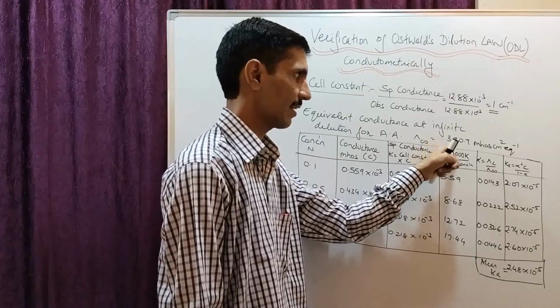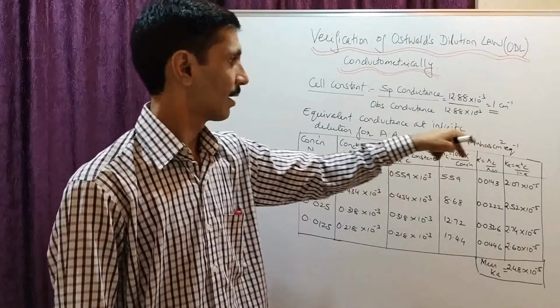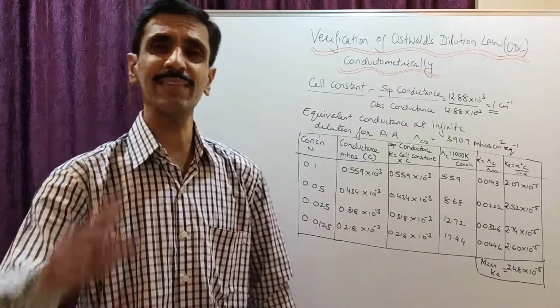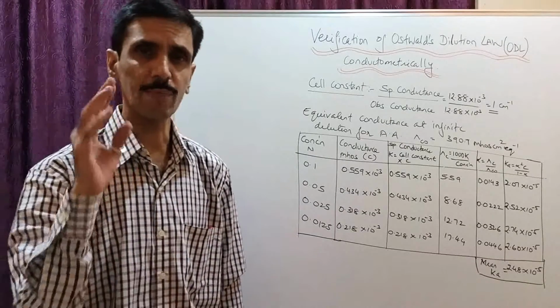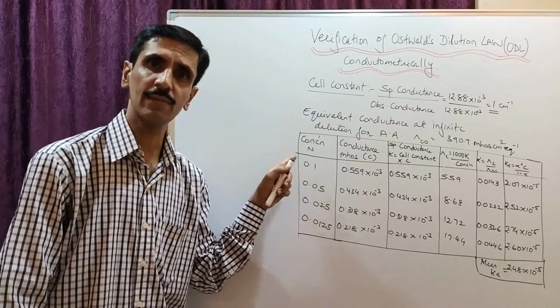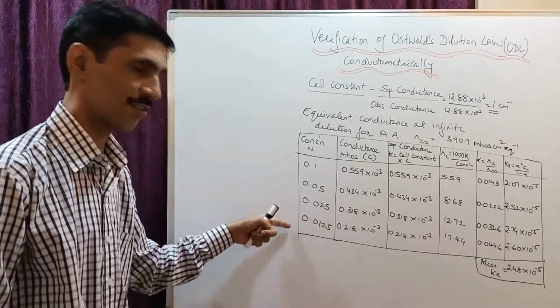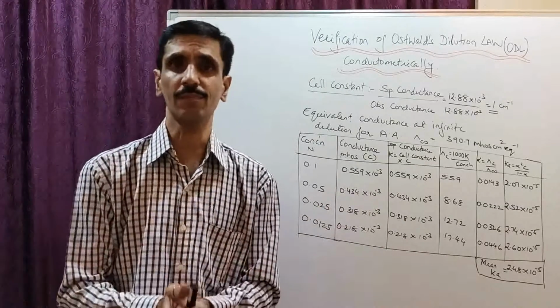and that is 390.7 mho cm square equivalent^-1. ये वैल्यू ऑलरेडी दिया हुआ है आपको. इनफाइनाइट डाइल्यूशन. नाउ व्हाट इज द मीनिंग ऑफ इनफाइनाइट डाइल्यूशन? दोस्तों अगर आपको याद है, मैंने जब प्रोसीजर आपको बताया था तो स्टॉक सोल्यूशन हमारा क्या था, 0.1 नॉर्मल एसिटिक एसिड. उसमें से हमने उसको डाइल्यूट किया और ये सारे कॉन्सेंट्रेशंस बनाए. तो डाइल्यूशन की वजह से there was a change in the concentration.